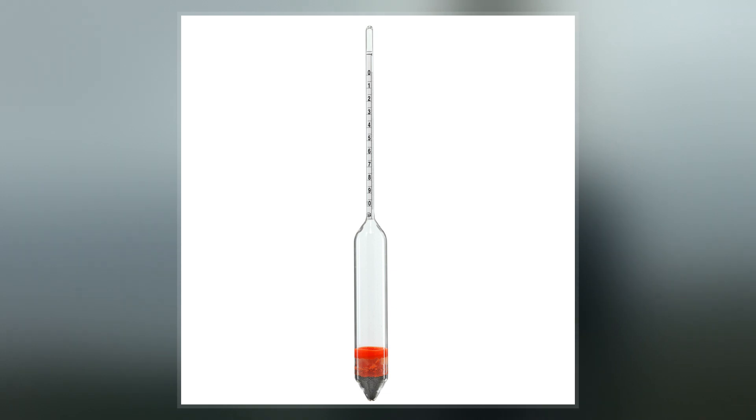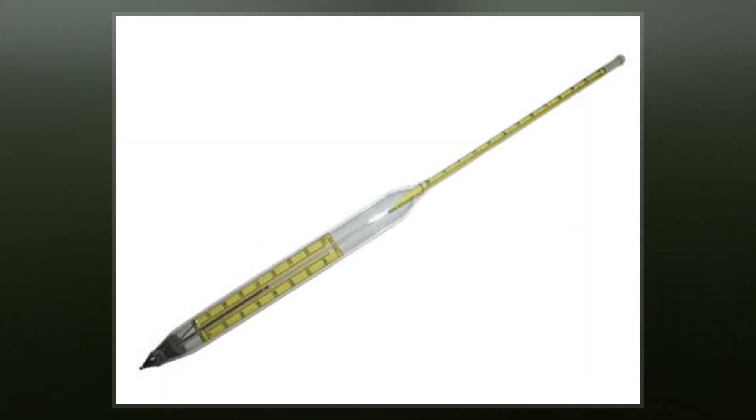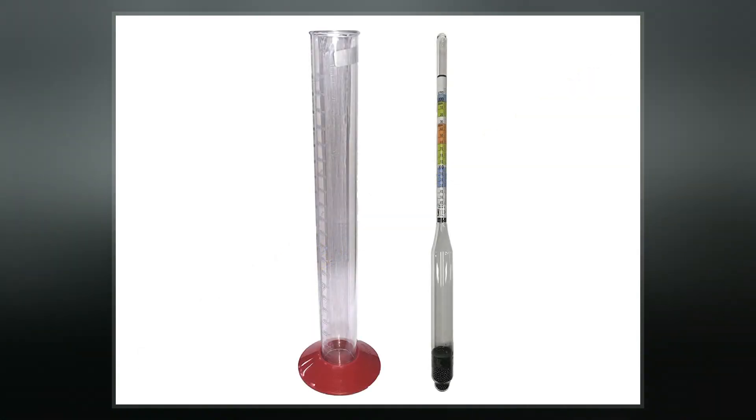The liquid to test is poured into a tall container, often a graduated cylinder, and the hydrometer is gently lowered into the liquid until it floats freely. The point at which the surface of the liquid touches the stem of the hydrometer correlates to relative density.